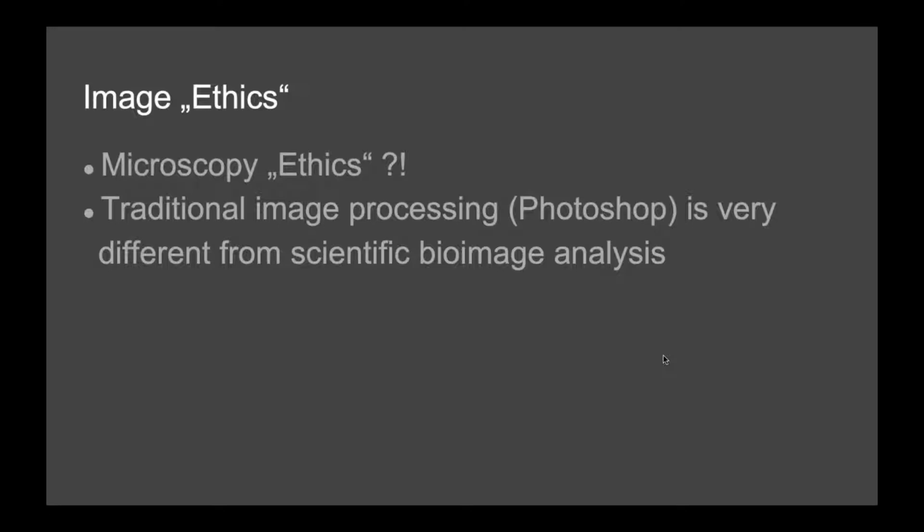but somehow I think it's not happening so much. And I think maybe the reason is that if you go to a microscope, you already feel like a scientist. You're already doing your science, you're in a science mode. And maybe it's just a hypothesis. The thing is that if people see images, maybe you also think about daily life images, and then maybe Photoshop, and then it can more easily happen that you apply the image processing that you would apply in daily life to scientific images.